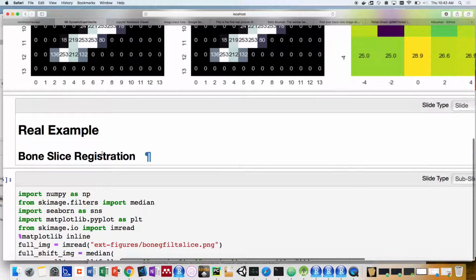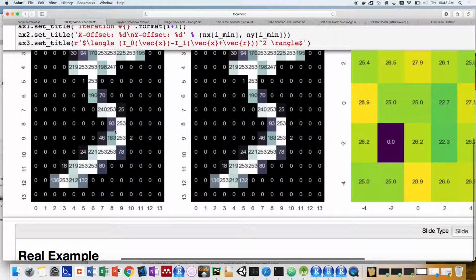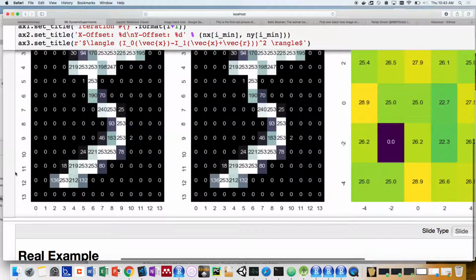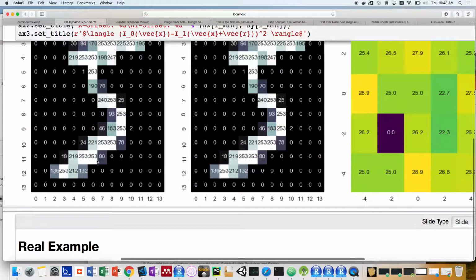And so now to transition, using this example is fairly easy. As we can see, these images are in fact exactly the same. One is just a shifted version of the other one, and so we'd expect them to be able to match perfectly. But of course, real images are more complicated and aren't just black and white. They have much more ranges of colors.